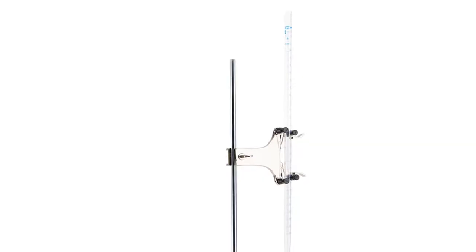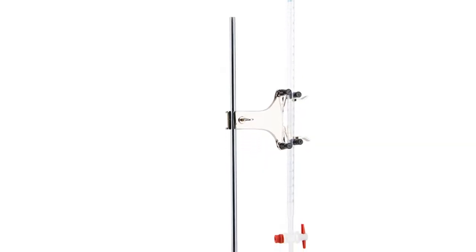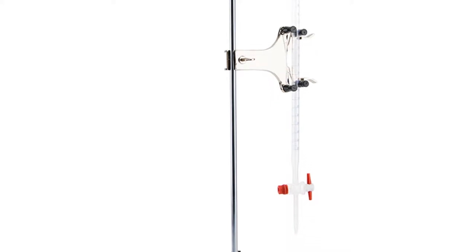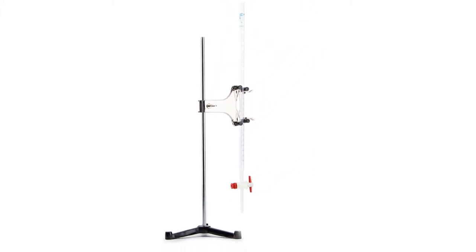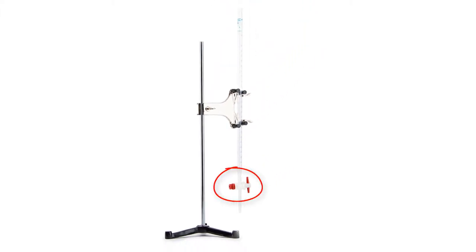When you need to measure a variable amount of liquids to high precision, the burette is a handy option. All burettes look pretty much the same. They're long and skinny with graduations and a stopcock on the bottom. They differ from a graduated cylinder in that the liquid is added to the top but dispensed from the bottom.